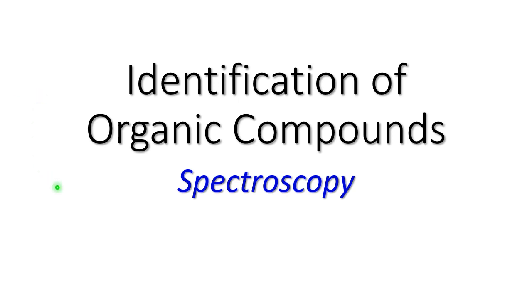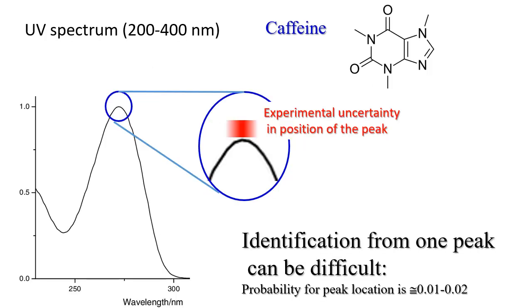So now, when we have our sample, we need to identify the organic compounds we have in it. With inorganics, as we have seen before, it's relatively easy because atomic elemental spectroscopy gives you an unambiguous answer to a question, what elements you have. With organic compounds, we have literally millions of them, so the answer is not that straightforward. The simplest way is to use common spectroscopy.